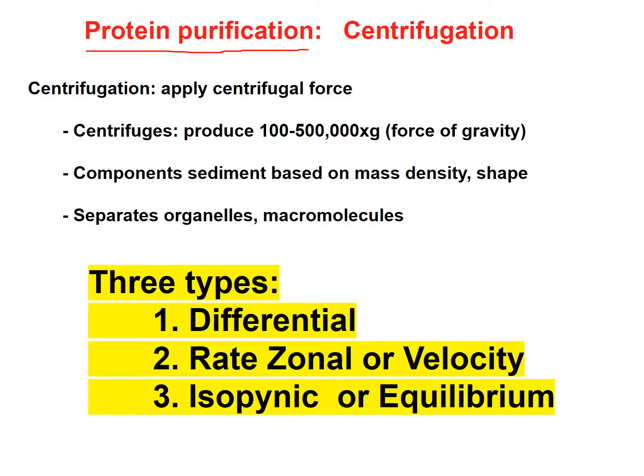So we have three flavors, okay, chocolate, vanilla, and strawberry flavored centrifugation techniques. And right away, you can see one of the landmines when you have to discuss centrifugation is to make sure you understand what these three are, when they're used, how they're used, what they do, what the limitations are.